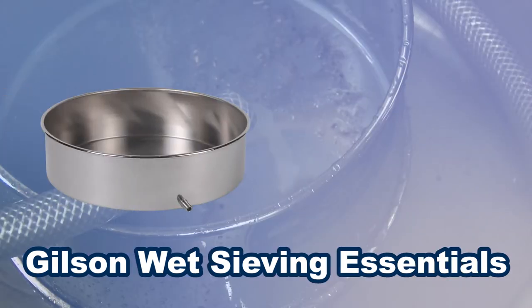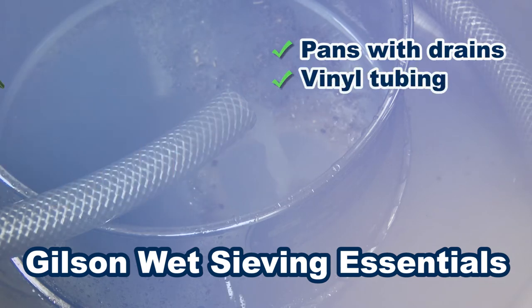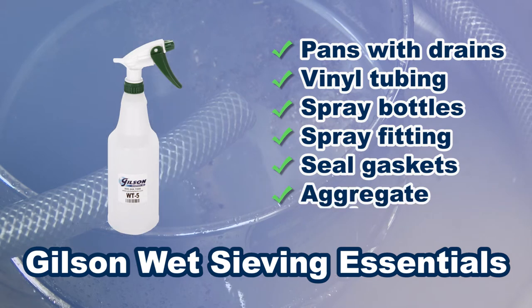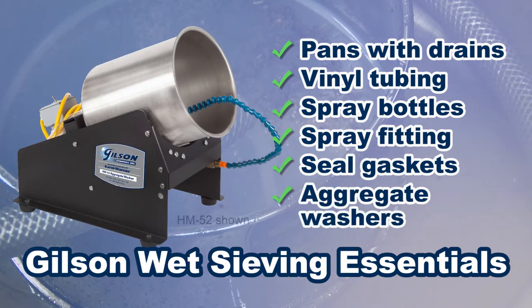Wet sieving essentials round out your wet sieving needs with pans with drains, vinyl tubing, spray bottles, spray fittings for faucets, seal gaskets, and the popular aggregate washer.